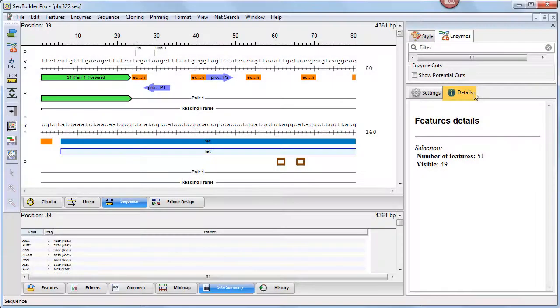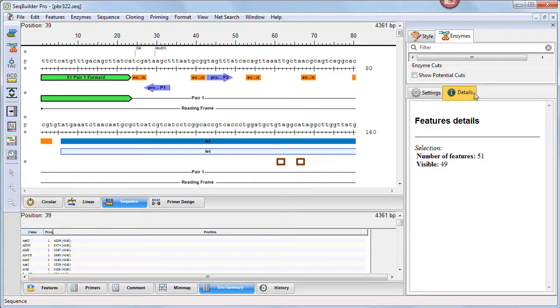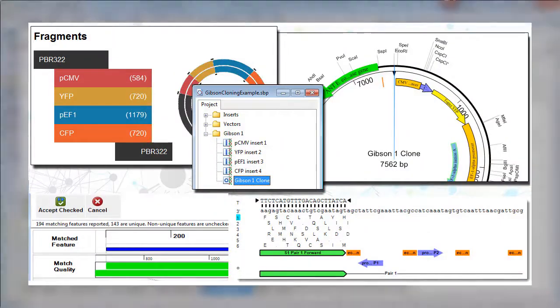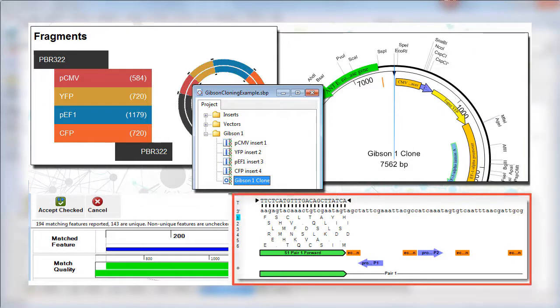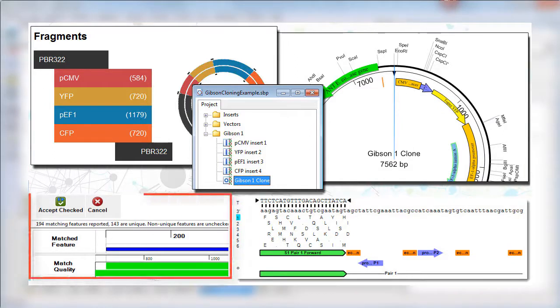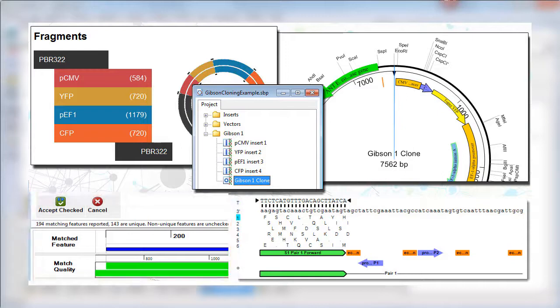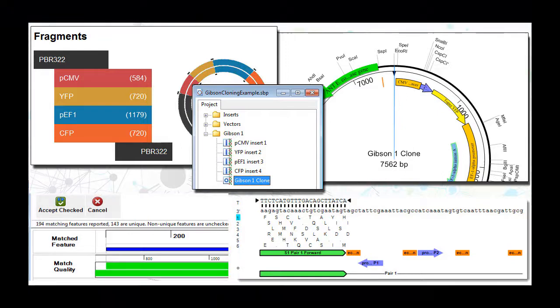The Details panel displays information about an active view or selection in the document window. As always, SeqBuilder Pro continues to offer automated virtual cloning and primer design, as well as the ability to update or add plasmid features automatically. Those workflows are each covered in separate videos.